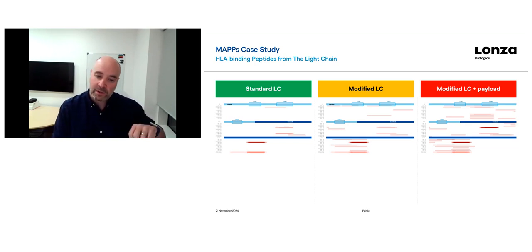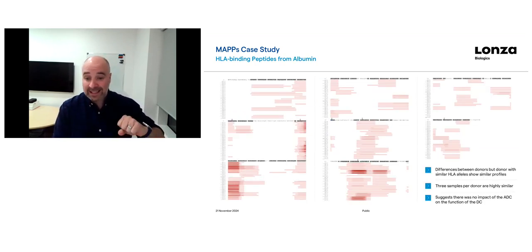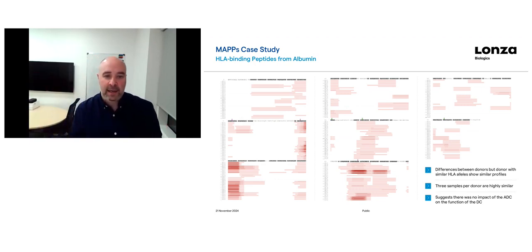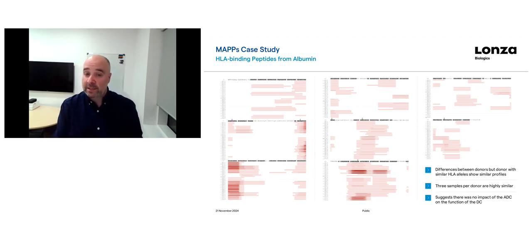So I mentioned earlier, one of the controls that we use is human albumin. This is a key control to check that we're not just seeing this with every protein that's in the sample. The nice thing about albumin is that, although we don't use any serum in our assays, the serum replacement factors we have in our media contain albumin as a large component. The dendritic cells shouldn't be producing albumin themselves. So the albumin is entering the dendritic cells through exactly the same pathway as the antibody that we're treating into the media on top of those cells. So it's a really nice control for going through the same process as the test drug.